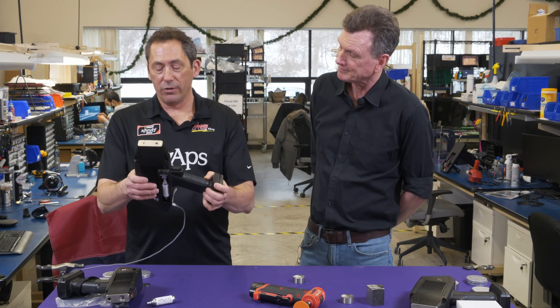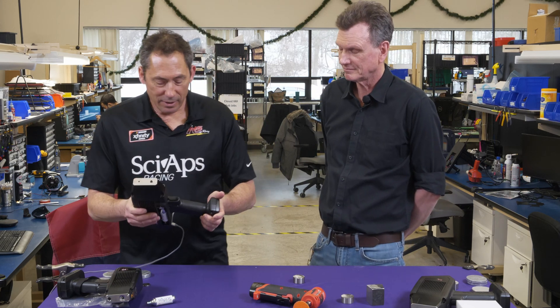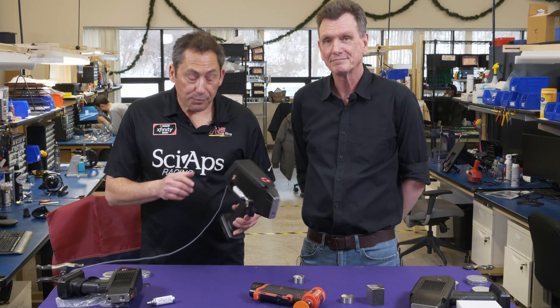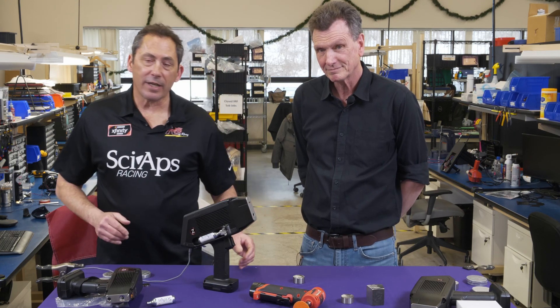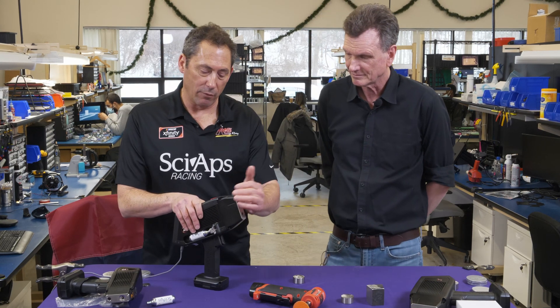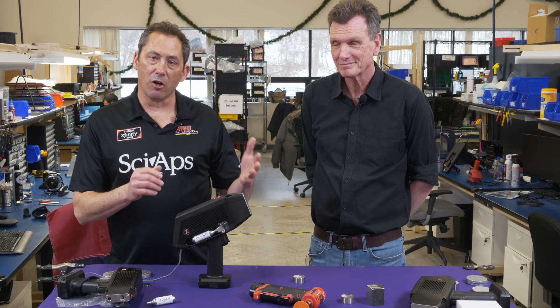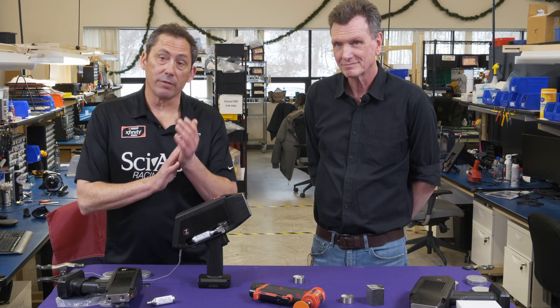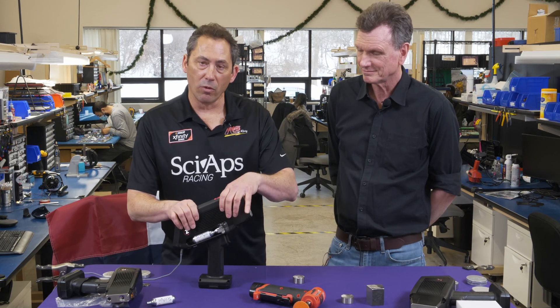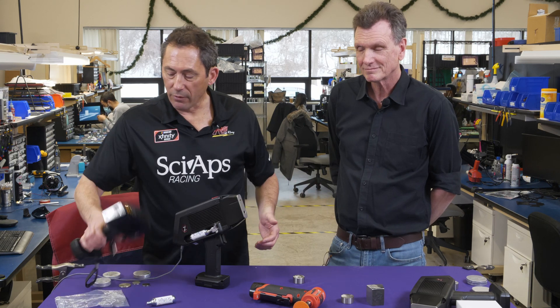This unit we're introducing is called the Z901 CSI, and CSI stands for carbon and silicon — so this unit just measures carbon and silicon. When we came out with it, the accountants all said why are you making a unit that just does carbon so you can charge less money for it? We've been selling the full LIBS unit for carbon and all the other elements for several years now — we've got over a thousand of them in the field, approved for use virtually everywhere in the world.